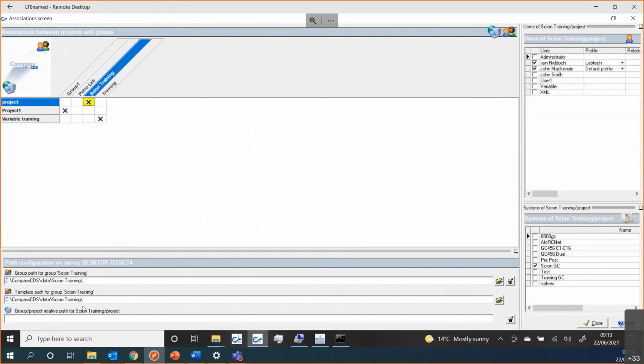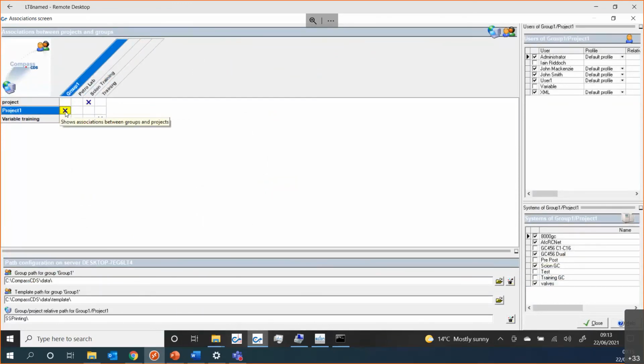It's quite a nice visual tool so that you can keep track of everything that is going on with all of the users. Now, for my system here, maybe not so important. We don't have that many users. We don't have that many instruments. When you start to get up to 30, 40, 50, 100 users with similarly 100 instruments or 200 instruments, using the data that you find in here to map and track what everybody is doing is certainly a very useful feature.